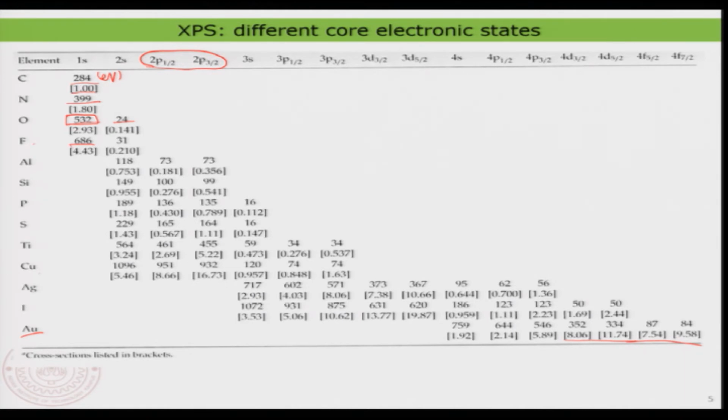For bigger elements you are also expecting core levels that are not just s states, you are also expecting something called spin orbit coupling. That means you are exciting an electron, and once the electron is excited, there is a spin orbital coupling. And due to that, you will have a new quantum number.